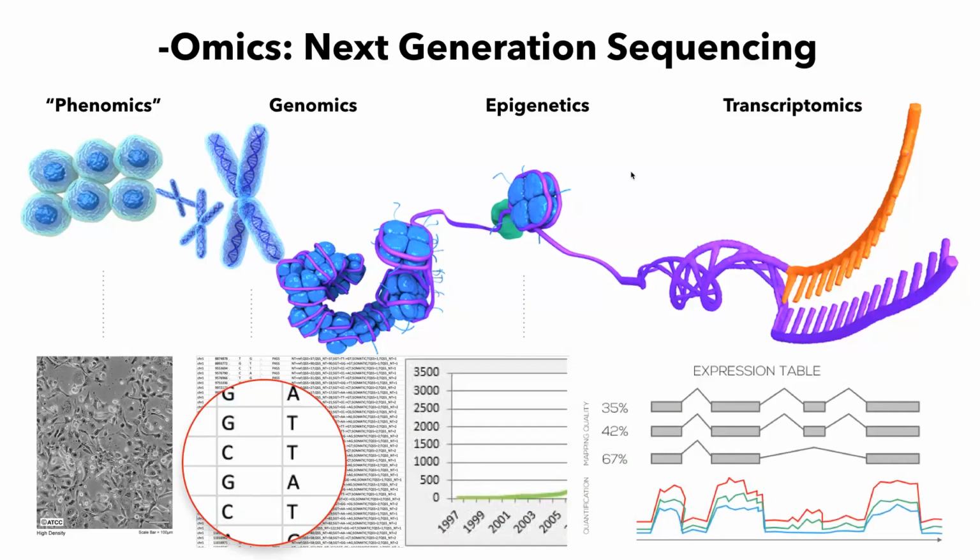And we can use it by processing next generation sequencing data that was prepared with different types of preparation kits. And then we can measure the signal. And sometimes if we have signal at multiple levels, integrate those signals to get a real systems biology perspective on what's going on and the underlying mechanisms behind the phenotype that we observe.